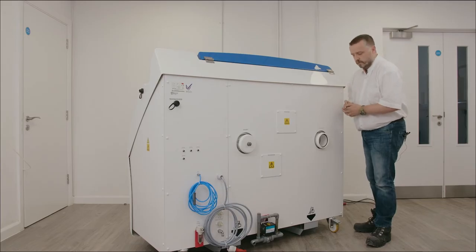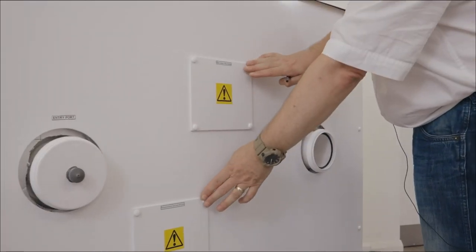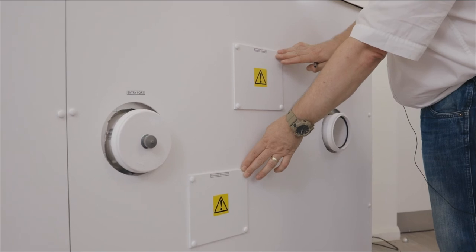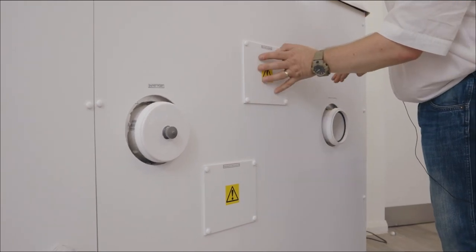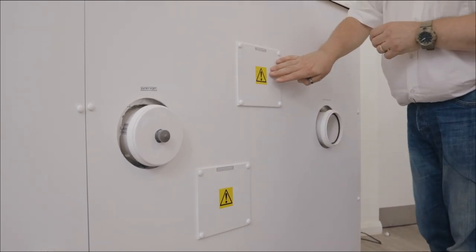To the rear of the chamber we have the exhaust port and towards the centre of the chamber we have two service access points where a service engineer can access the connections for the temperature sensors and humidity sensor.